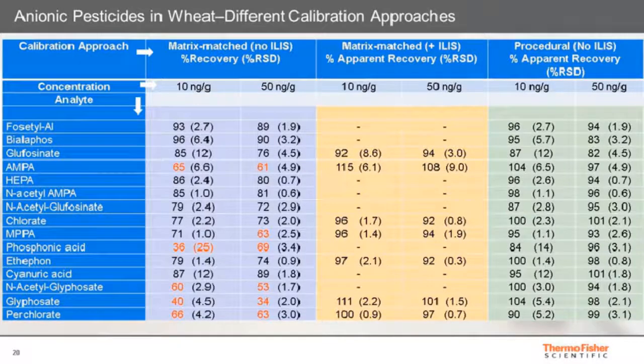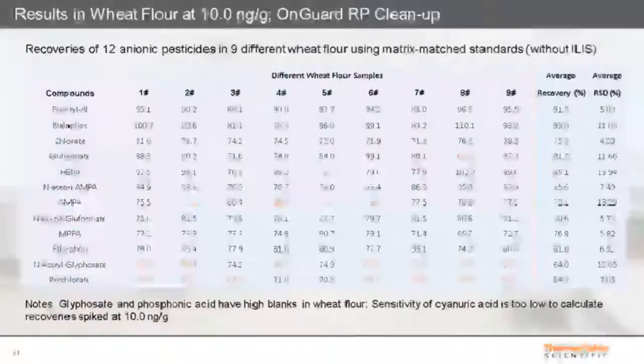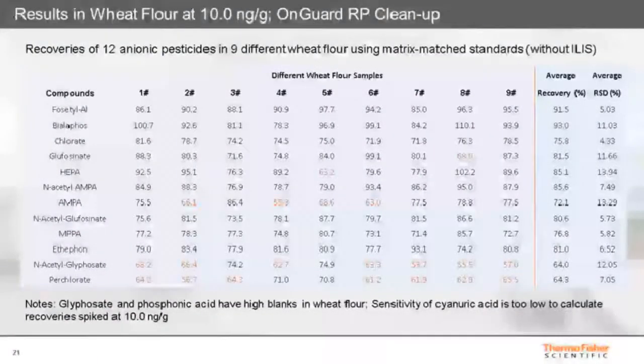Now, this apparently worked very well, but a word of caution that this is only validation using a single sample matrix. When we evaluated a number of different samples rather than just one individual sample, the results were more variable. Even if we use the same sample for exact matrix match spiking and calibration, as was the case in this table, and this means that results for sample 1 is based on spiking and calibration using the same sample, number 1. The result for sample 2 is based on the spiking and calibration using the same sample, number 2, and so on, which is the best scenario.